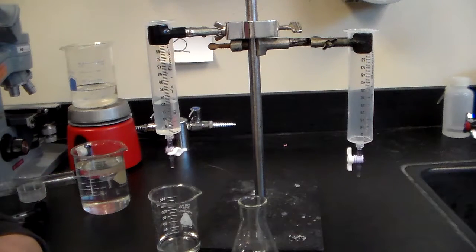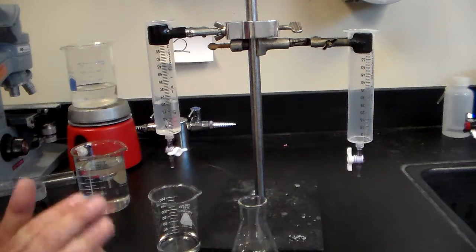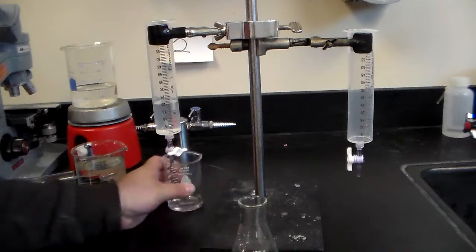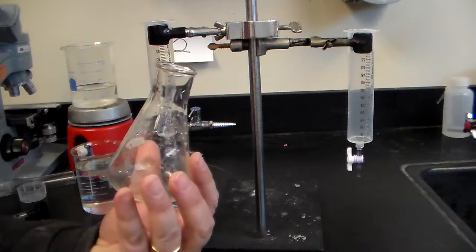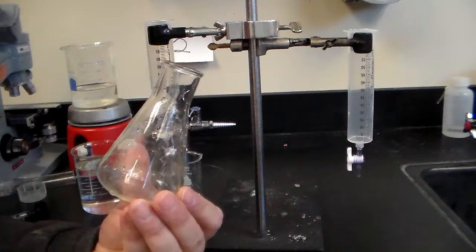Now we're at the point where we're going to do the titration. You're going to get your Erlenmeyer flask and you're going to get some indicator from your instructor, that would be Mr. Canoe.